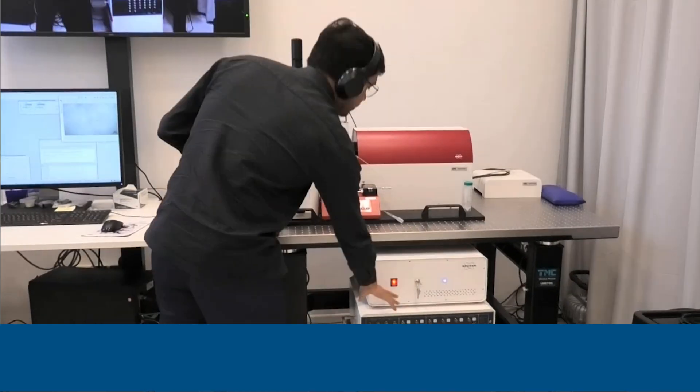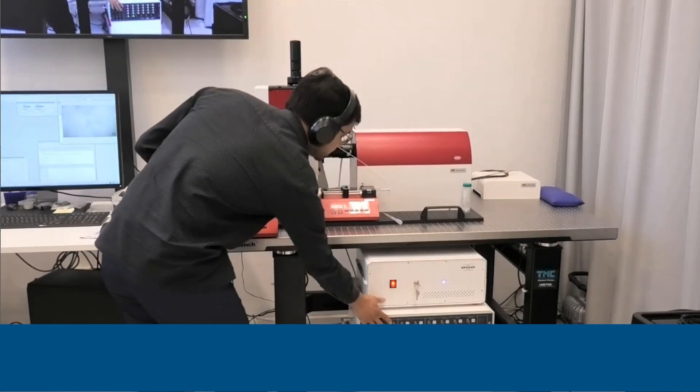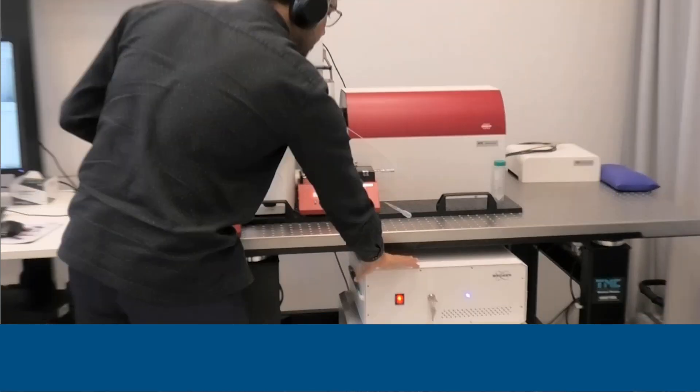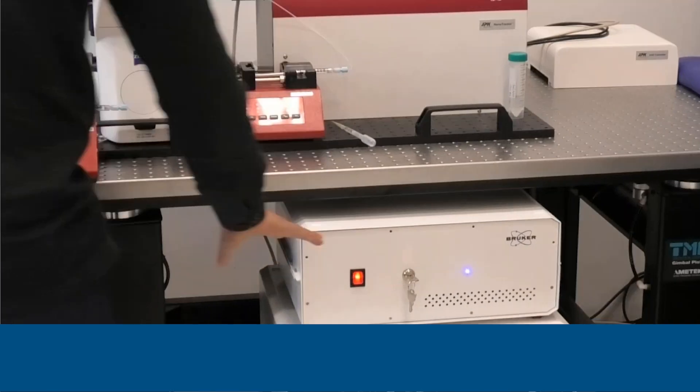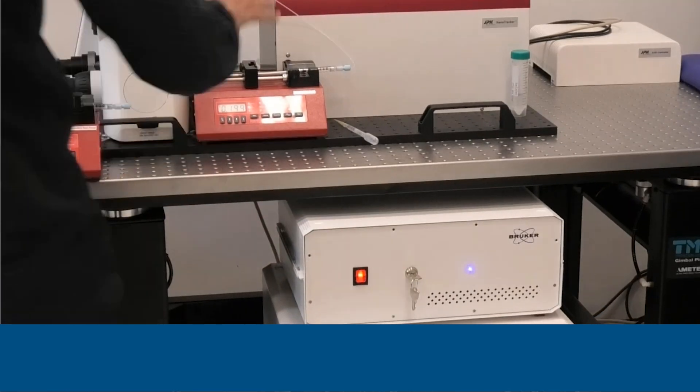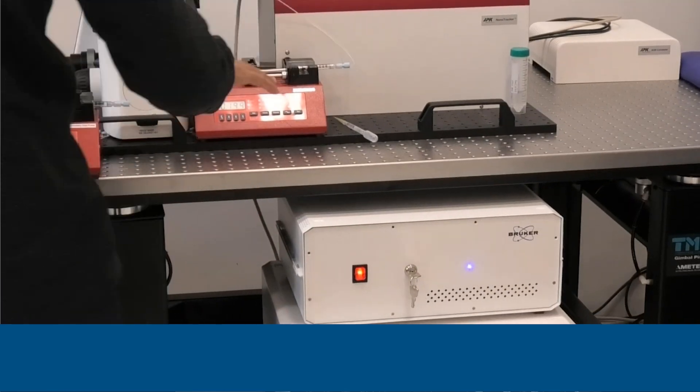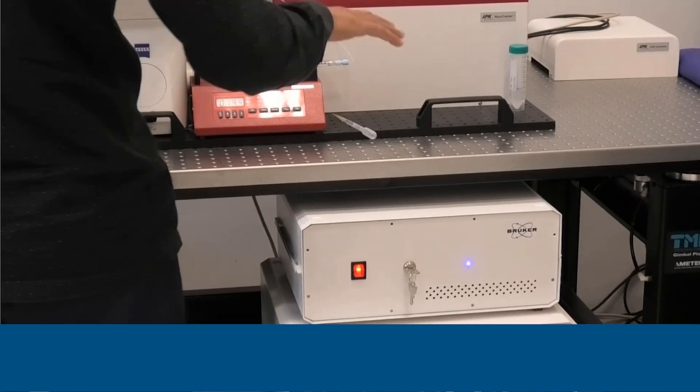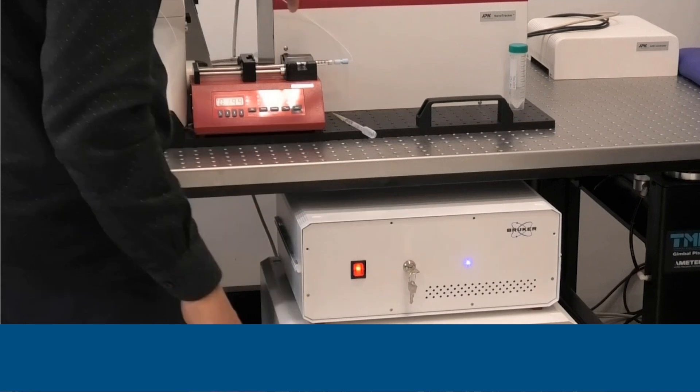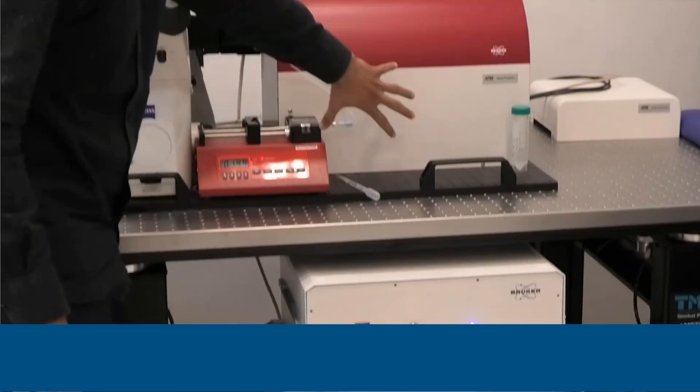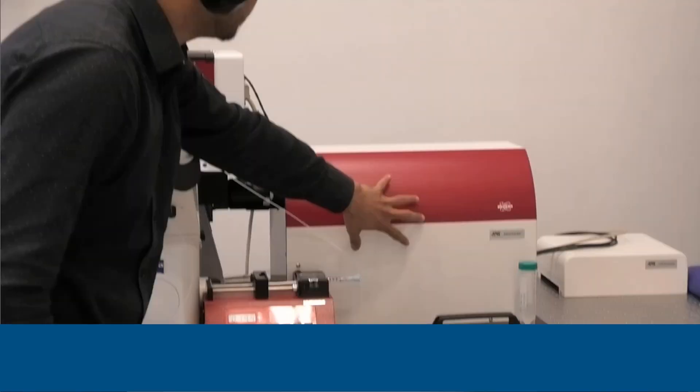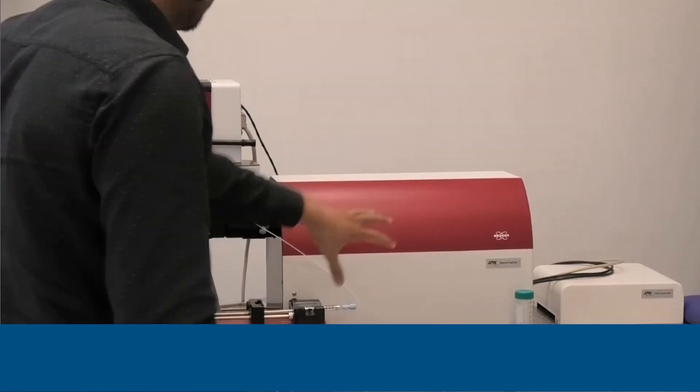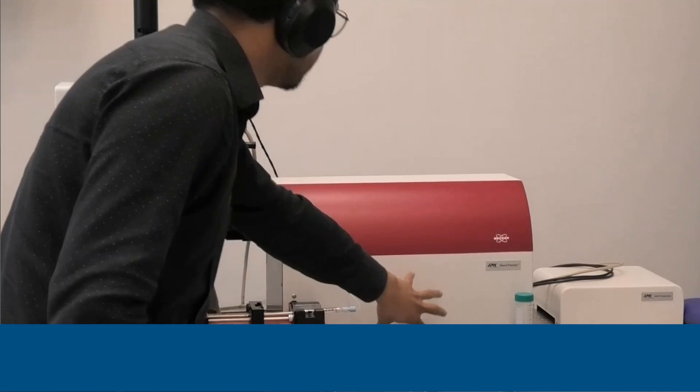On the top of the controller, which is this one, we have a laser box, which is a laser power supply box. The laser sits on our laser steering unit, which is right here.